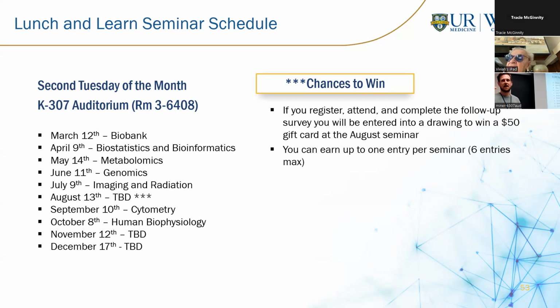Beyond that, we've had discussions in building sort of a genomics library for these specimens, right? If we can secure funding for a simple RNA-seq run or Sanger sequencing on these specimens, building our own catalog of useful genetic information or genomics information to pair with these, we would like to do. I think we can. It's just taking us some time to build that and figure out how we're going to go about it.